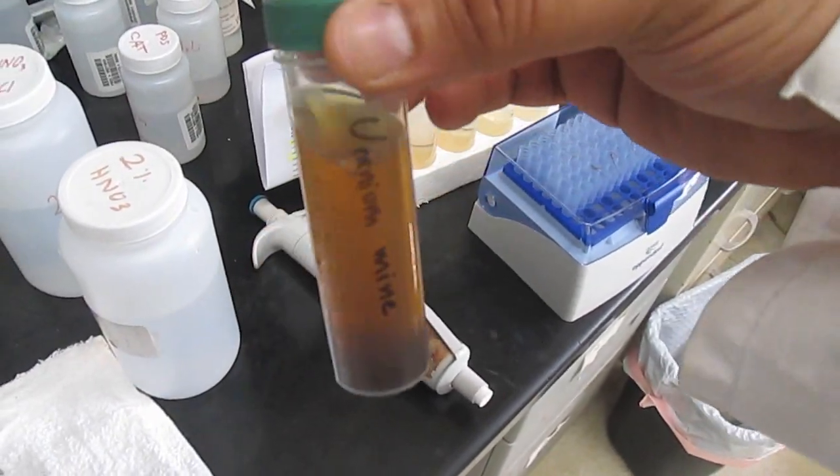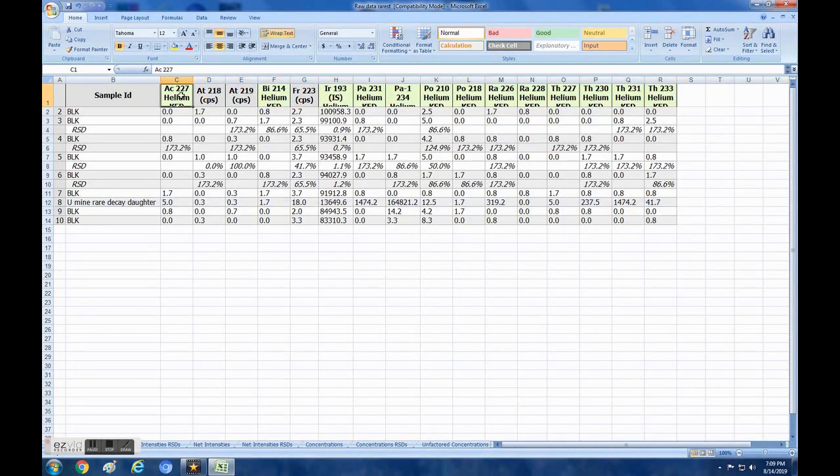Outside of the expected overlapping masses, called isobaric interferences, I did get good confidence factors for protactinium-234, radium-226, thorium-231, and polonium-210. The francium hits are likely to be interference caused by oxygen and lead.